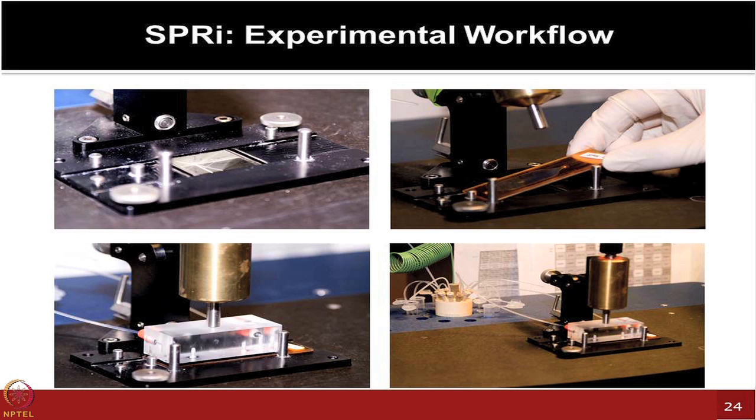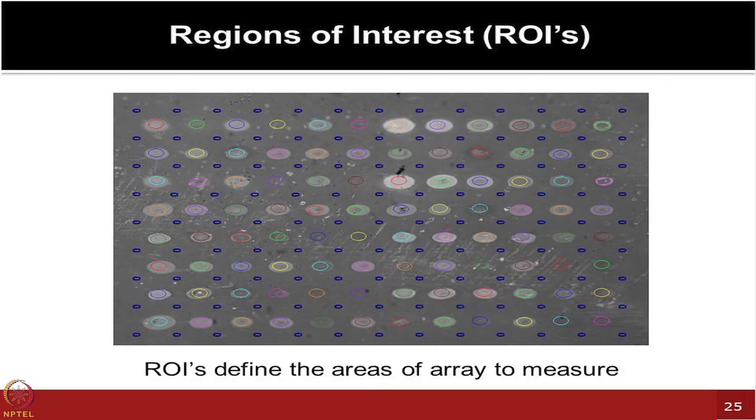So these kinds of platforms could be used, and they result in these images, which are the pseudo images that I mentioned to you. It shows you these kinds of spots. All these red and green ones are actual spots, but along with them, the gray color is just the background. The software artificially adds some blue dots, and these spots can be used for subtracting the background.